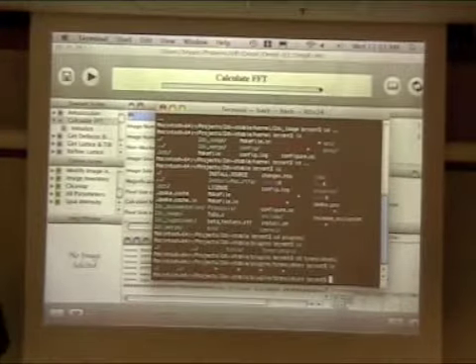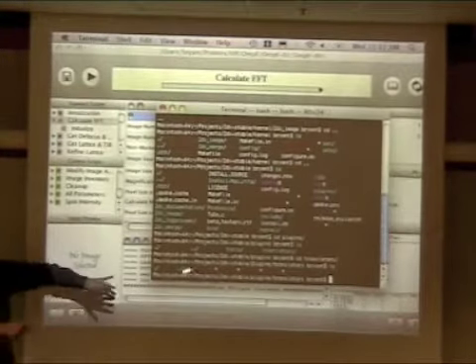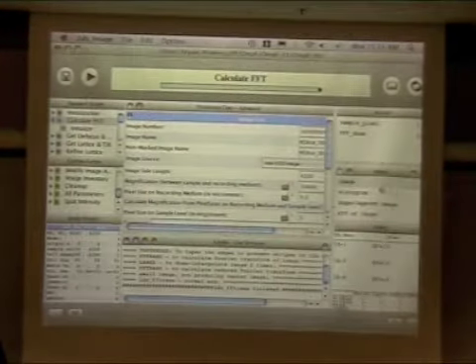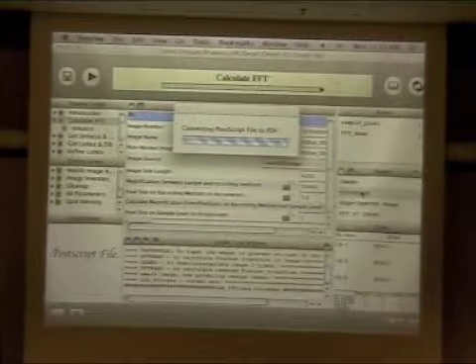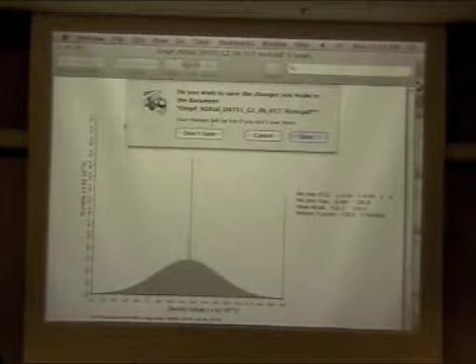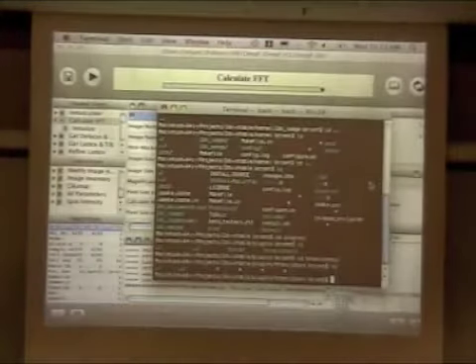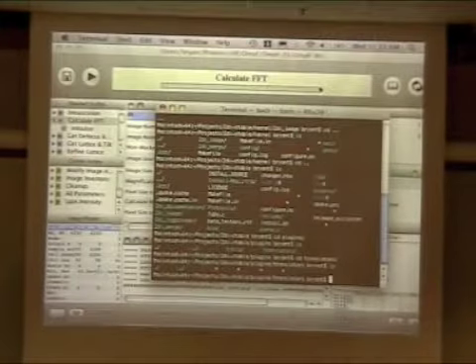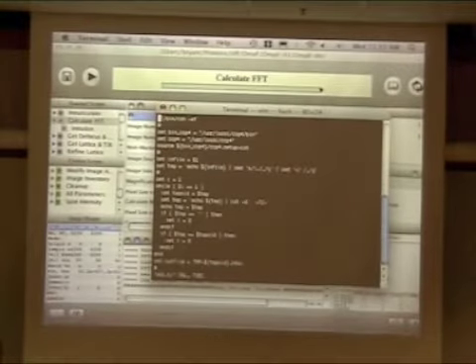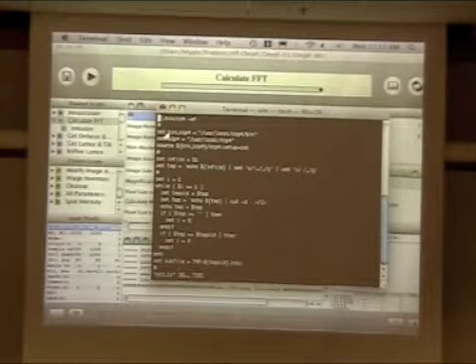If you put a 3-letter name representing a particular extension of a file, followed by a .tr, this directory is parsed whenever you double-click on a file over here in 2DX. So for instance, if I were to double-click on, hopefully, histogram, it's going to automatically launch our PostScript viewer, bring it up, look at it. Okay, that's a default behavior. If, however, you have some other thing you want to do, for instance, MTZ files are compressed data that you oftentimes want to look at in an HTML browser, then what you can do is add a mtz.tr, and have a look at that. And what you can see there is basically whenever an MTZ extension file is double-clicked, it runs this script.